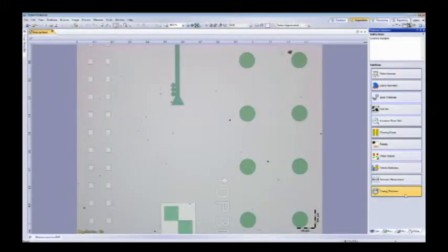Coating thickness is another new solution module. That one allows us to measure coatings that are put on surfaces. A lot of times with metals, they'll put a coating on for surface matte finishing, and they'll want to measure those thicknesses. That can be done here, and I'll show you that as well.